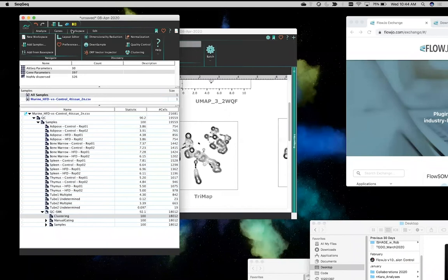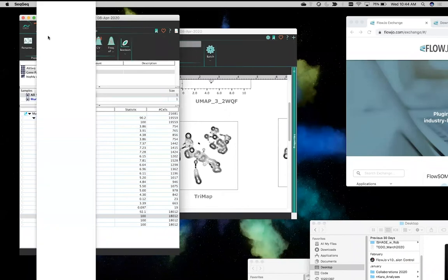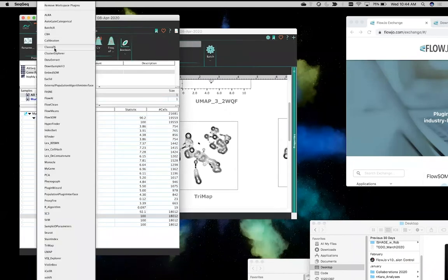Other clustering algorithms are all going to be available through plugins. So let's look at some of the plugins. Basically, I want to draw your attention to XShift, which is a clustering algorithm that runs in Java. So it's very easy to set up. It's also pretty fast and fairly robust. Another type of clustering might be available if you're running the Seurat pipeline.